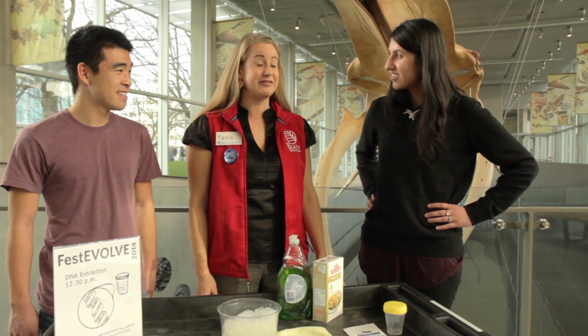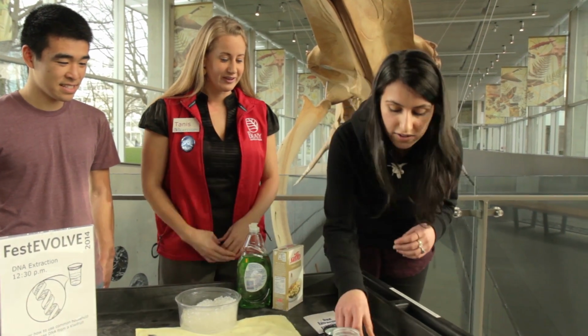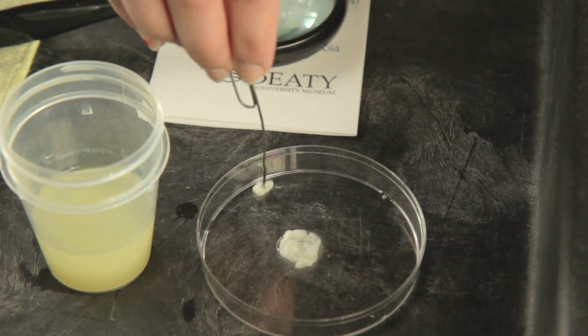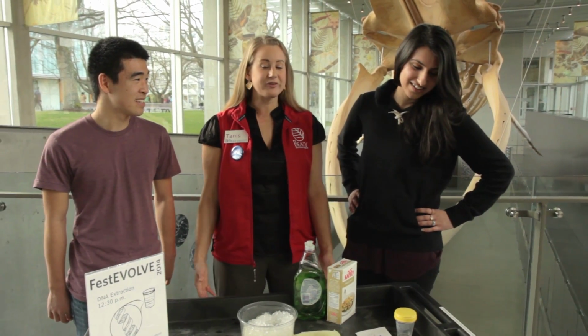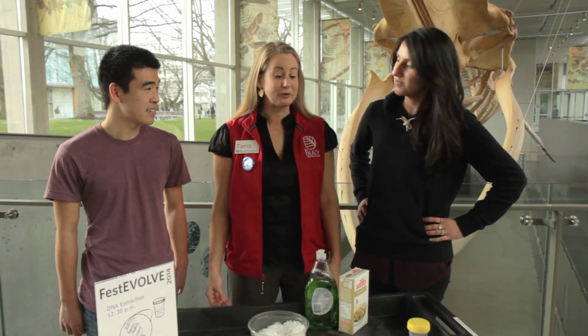So for even more fun, we can actually scoop some of the strands of DNA out to take a closer look at them. Okay, cool. If you like, yeah. So what we've just seen is thousands of strands of DNA coming out of the cells from the kiwi fruit. It's really cool to be able to see that with your bare eyes.